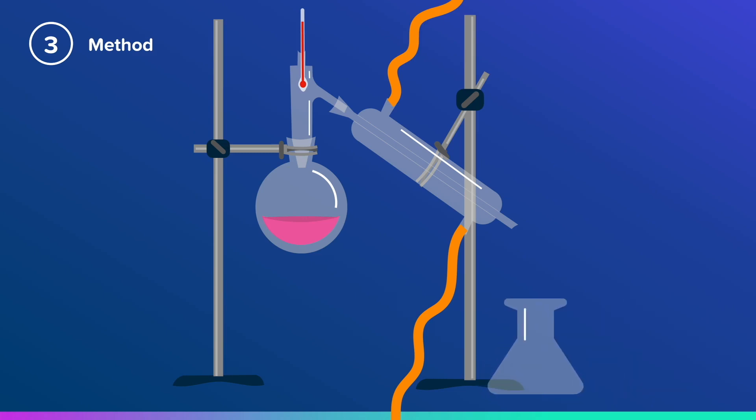Next, place a conical flask under the end of the condenser. Your liquid should be able to drip from the condenser into the conical flask. Really make sure it's underneath. Then you'll need a Bunsen burner, and it should be able to move under the round-bottomed flask.